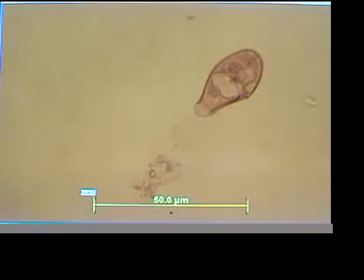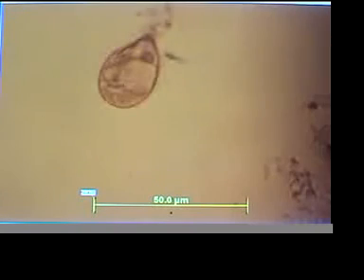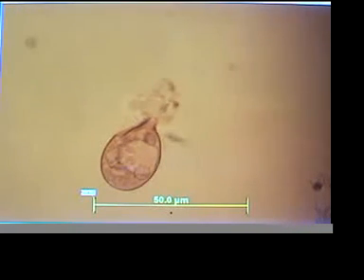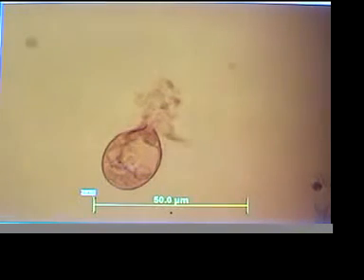Let's check the scale is correct. And we have a partner of his who's maybe better. So with the microscope I'll show this. Yeah, this is real time. In the same grid. Hey, there we go, a real-time explosion. Devitalization. Let's get a little more contrast in there.